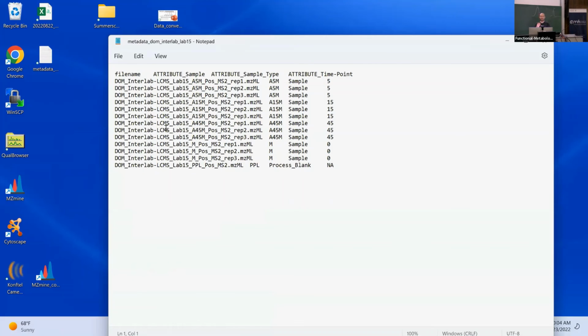And I think that is the key to actually make use of this data. Without metadata, this is all worthless. So that is a step with which I would perhaps be more hesitant to directly make the metadata public if it's a really sensitive project where I might be afraid to get scooped, right? But you don't have to do it right at the beginning, you can do it at a later stage. And this metadata evolves, right?